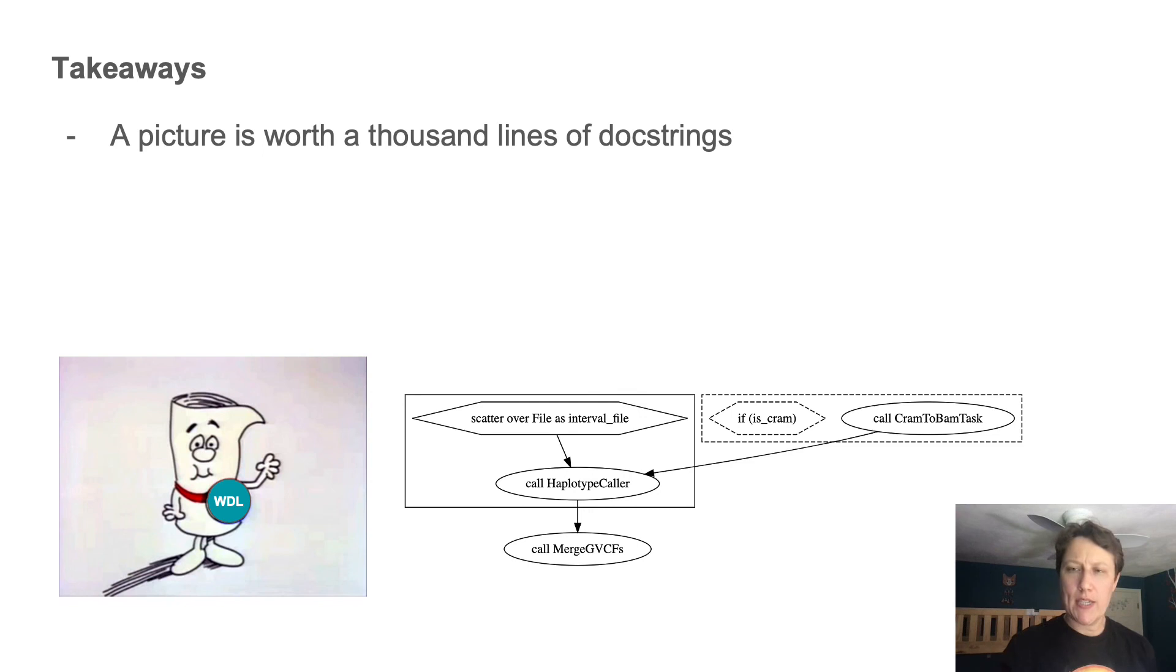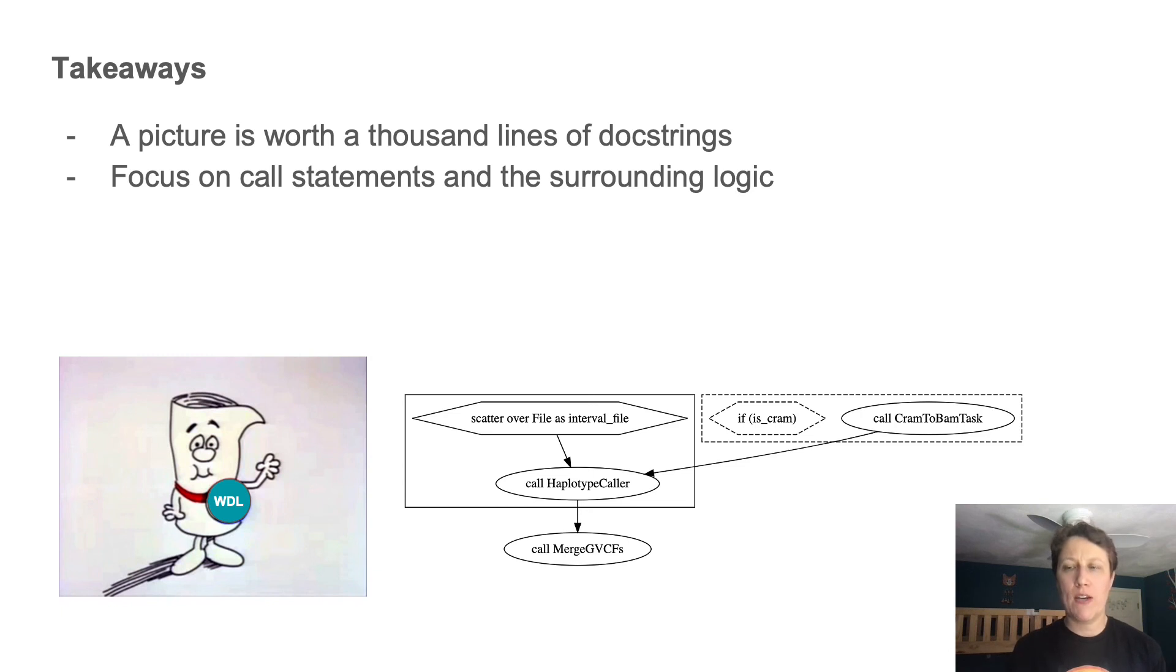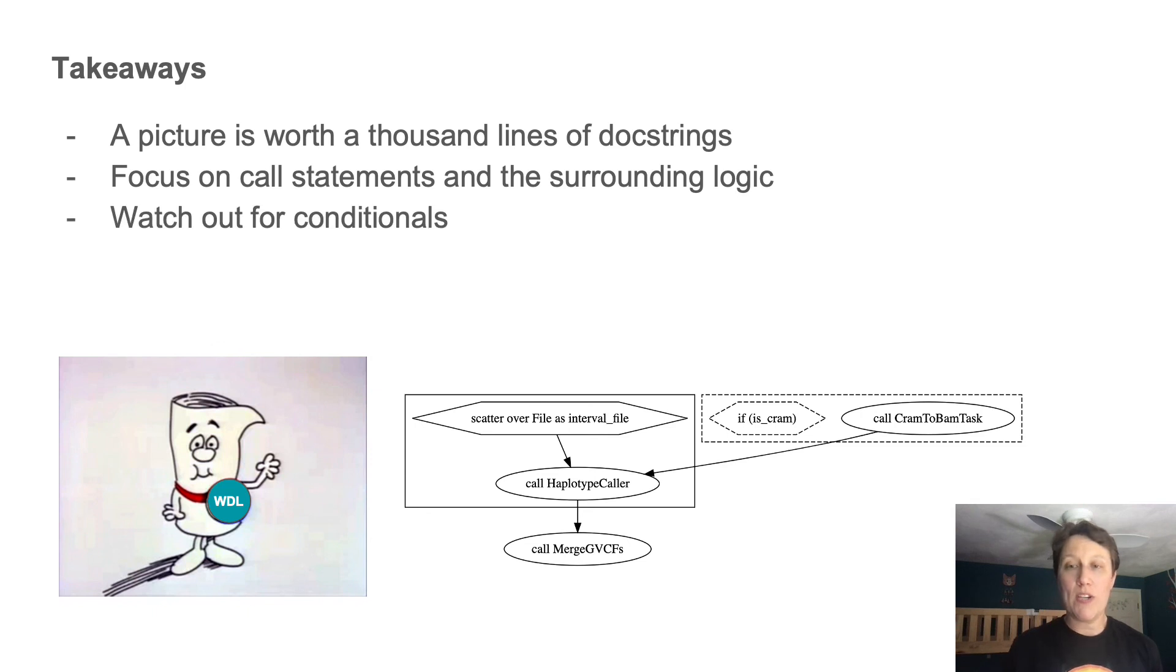When you're connecting the code to the picture, focus on call statements and the surrounding logic first. Ignore everything else up until the moment where you can't ignore it anymore.